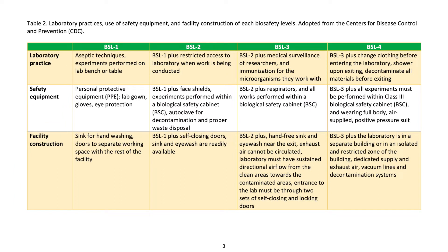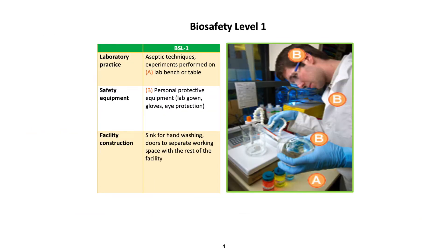Laboratory practices, use of safety equipment, and facility construction for each biosafety level are adopted from the Centers for Disease Control and Prevention (CDC). BSL 1 laboratory practice: aseptic techniques; experiments performed on lab bench or table. Safety equipment: personal protective equipment (PPE) including lab gown, gloves, and eye protection. Facility construction: sink for hand washing, doors to separate the working space from the rest of the facility.